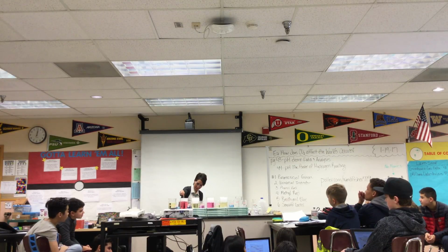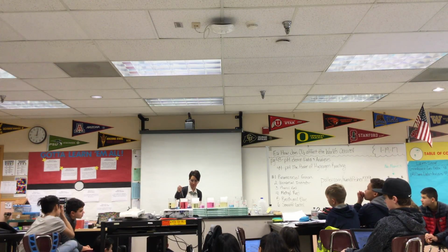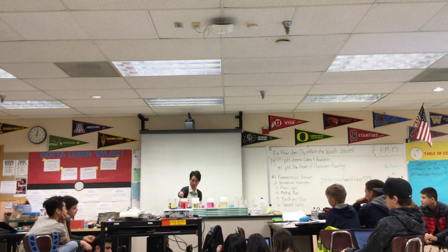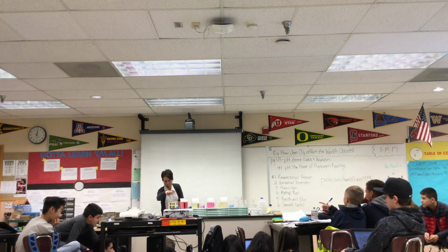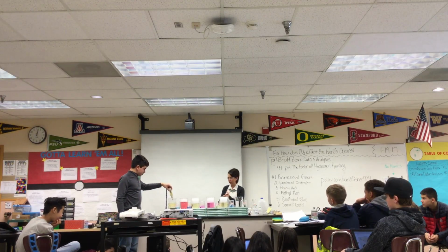There we go. A little bit more of a red color. Let's just throw some more in there for good measure. All right, let's go ahead and find our ending pHs real quick, because then we have to do a little prediction for our last one.